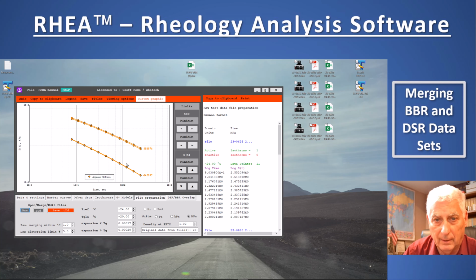Now, you'll see these are the isotherms of stiffness, whereas normally we would have isotherms of stiffness at 8 seconds and then 15 seconds, 30, and so on, 60 seconds. What we've got here is an additional data point in between. It's added this one at 11 seconds, which is logarithmically halfway between 8 and 15, or as close as we can get.